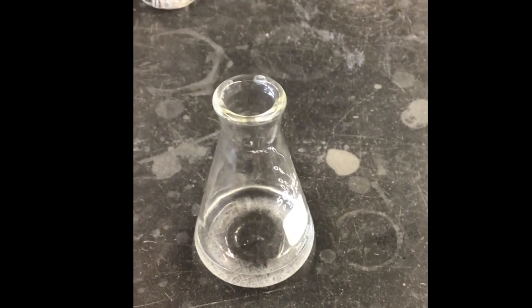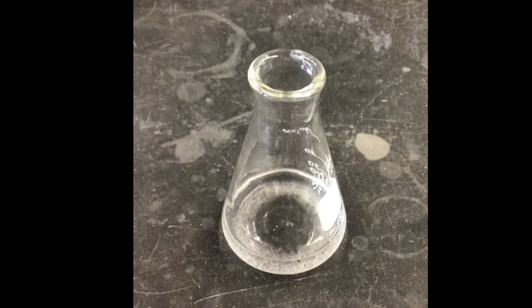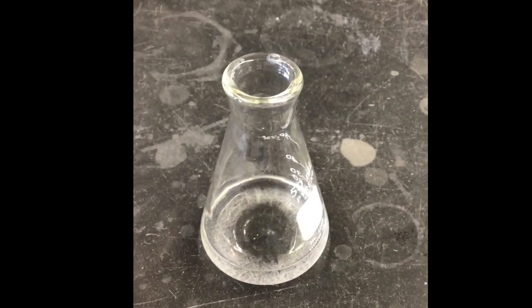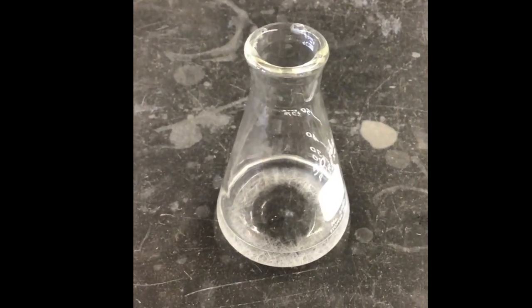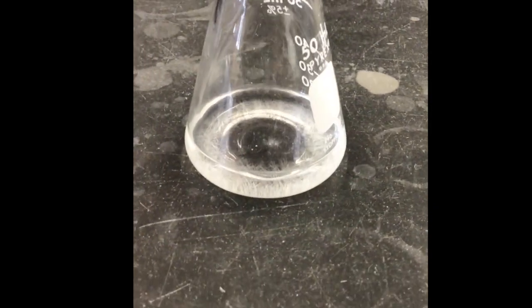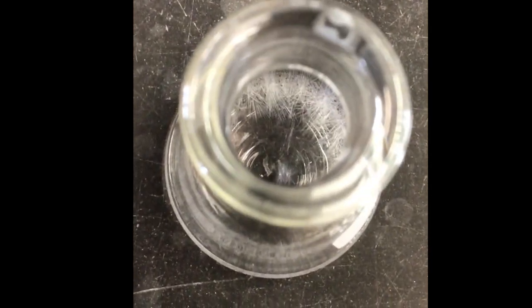So it adheres to it, probably intermolecular forces, and then once it sticks to it, another caffeine molecule will stick to itself, and then we get stacks on stacks on stacks of caffeine molecules to make these beautiful needles right before our eyes. Oh my goodness. Have you ever seen such a glorious thing?